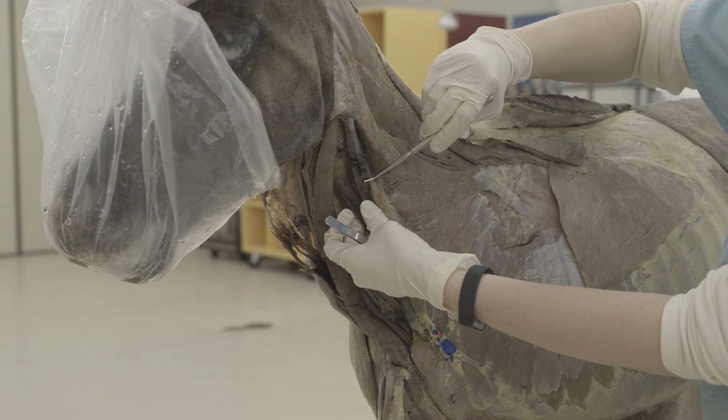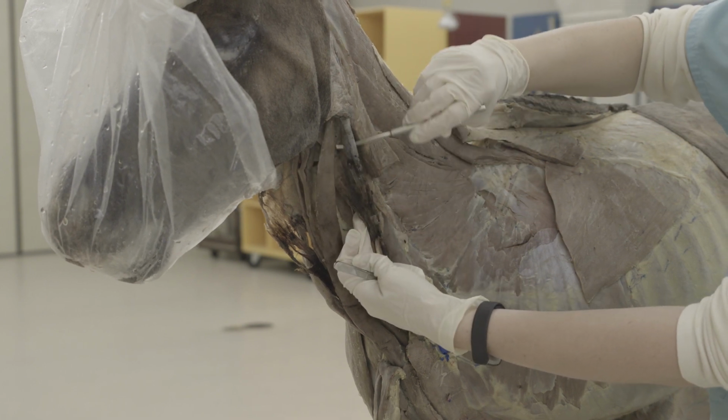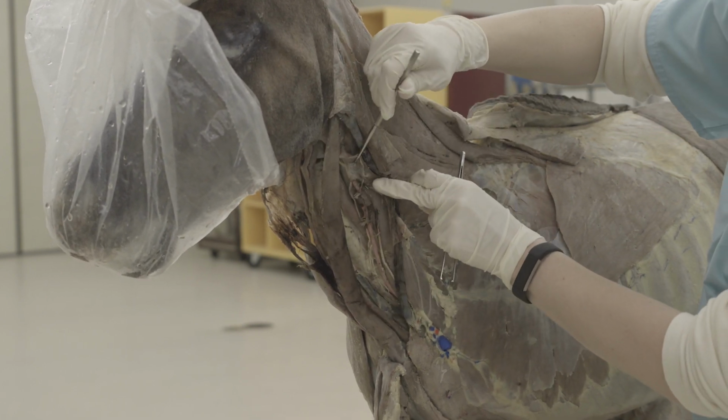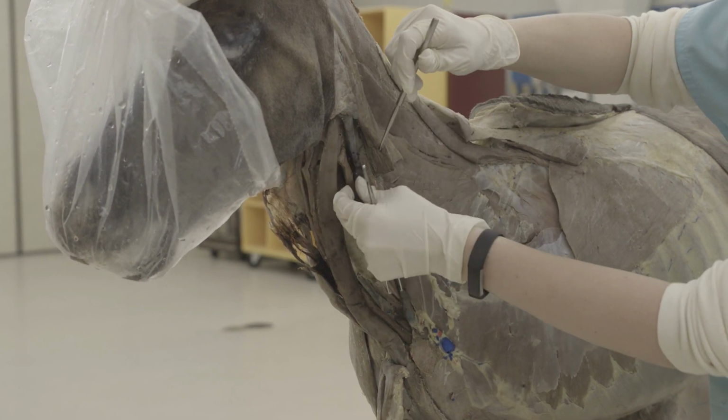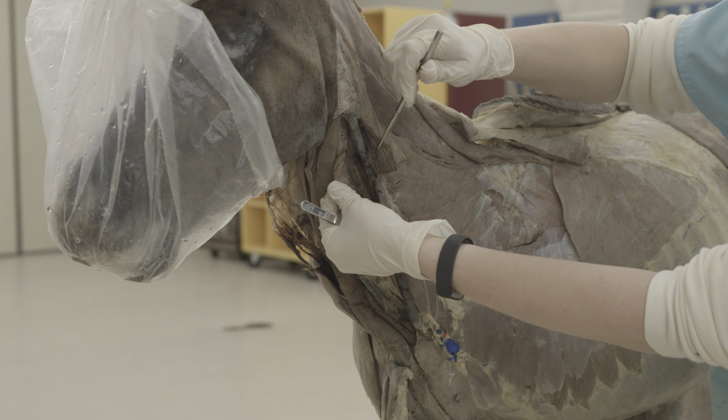And it's in between the external jugular, which you can see here, and the carotid. So you can see the carotid is the pink here. And it's interposed in between those two. So that's the omohyoideus muscle.